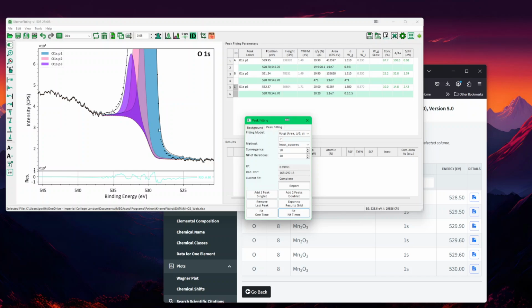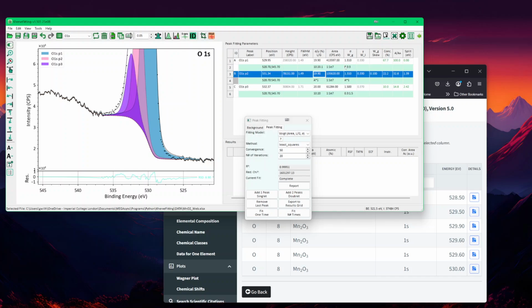And from this you can see that actually the LG ratio of 19.9 is too much. So that may want to go to something like, let's try between 10 and 20. And then the ratio of the next peak should be, because it's broader, also 10 to 20, not going to 20%. So let's make it the same width now, the same shape.